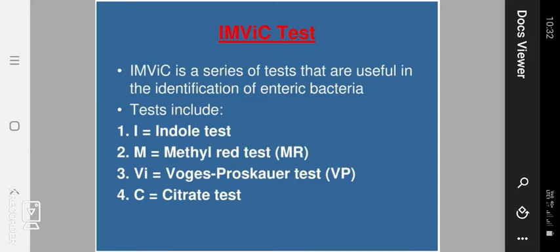The tests included are I, which means indole test; M, methyl red test; Vi, Voges-Proskauer test; and finally C, citrate test. Those 4 tests are called the IMViC test.